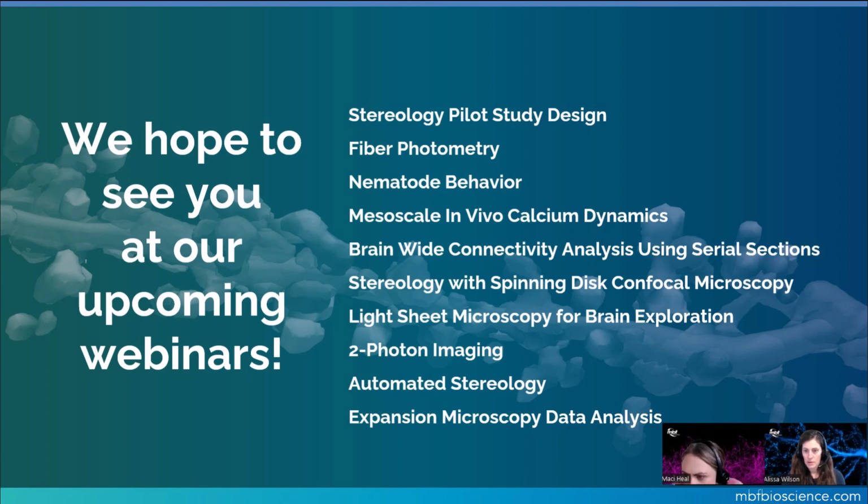And then, sorry, part of that question is how do you handle vessels that have different levels of signal? And for that, depending if they're in the same field of view, I would run two separate detections. So you can run automatic detections using one set of parameters, detect, let's say, the things that are closer to the foreground, and then run another set of parameters to pick up the vessels that are closer to the background using maybe a higher intensity.